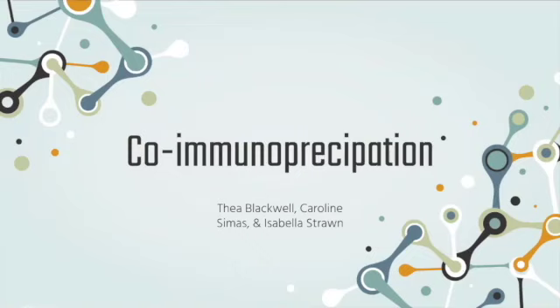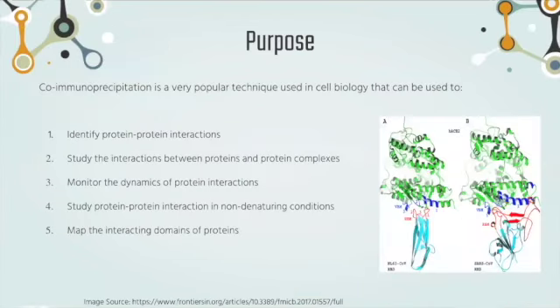Hello everyone, we're the group discussing co-immunoprecipitation. So now the purpose. Co-immunoprecipitation is a popular technique that is used in cell biology quite often.